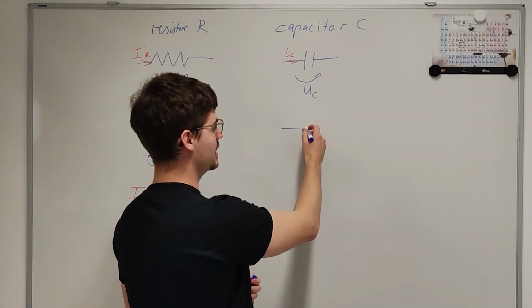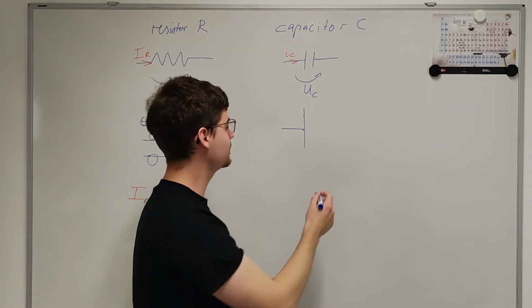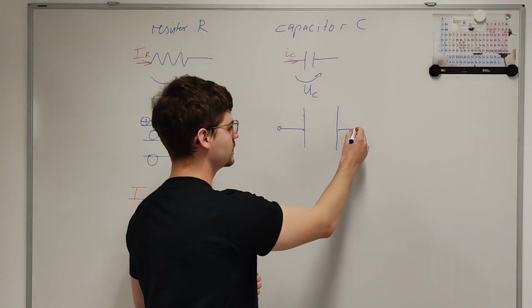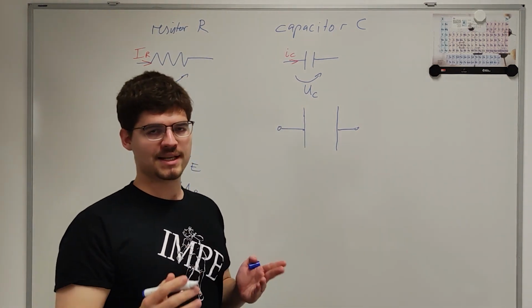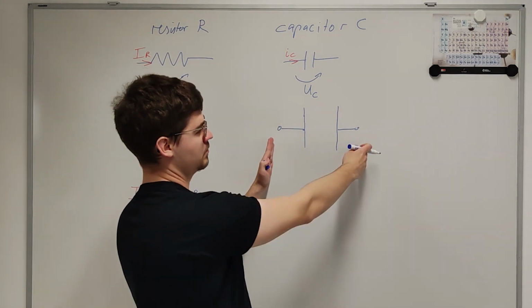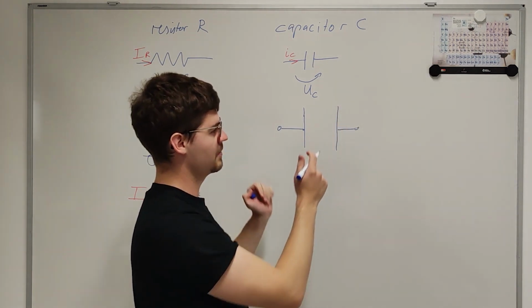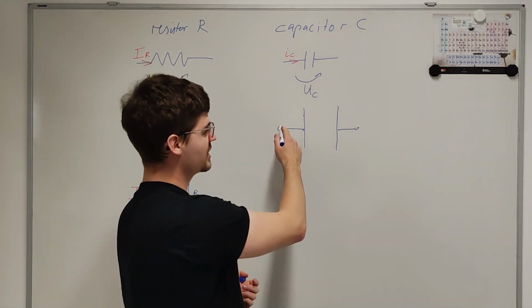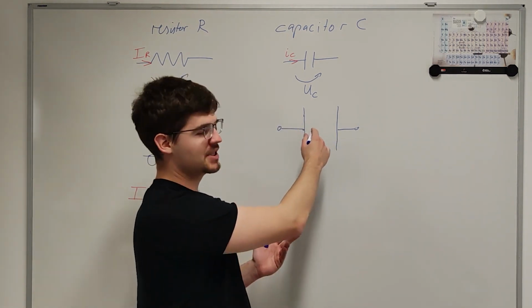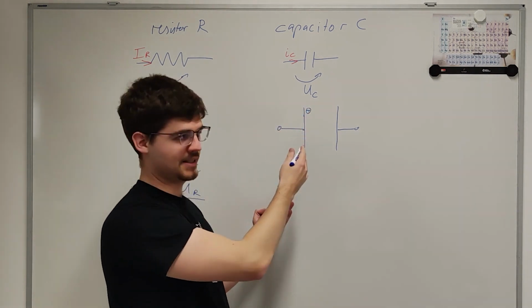Imagine now that we have the idealized plate capacitor. I will just draw it again here, larger. And we want to apply some difference in potential here. What do we do? We connect this externally and apply a difference in potential. Now, charge carriers will attempt to flow here, but then again they can't pass through this dielectric. Charge carriers will instead accumulate on these plates.